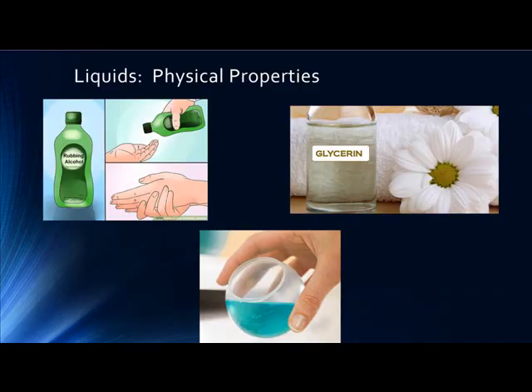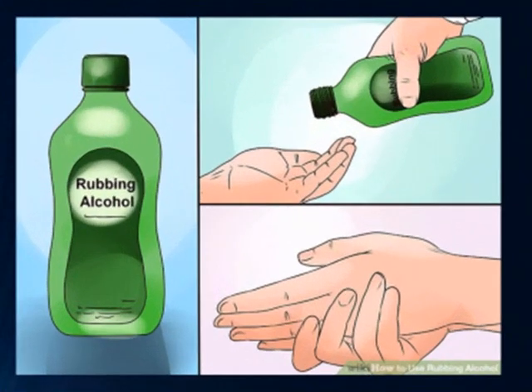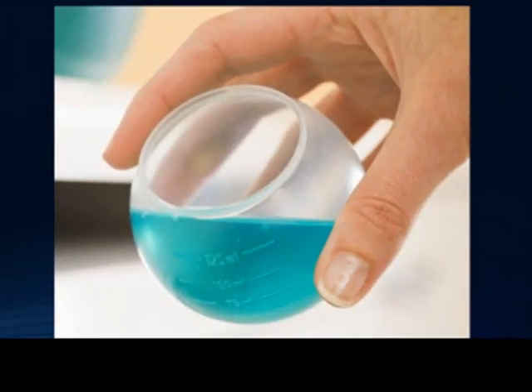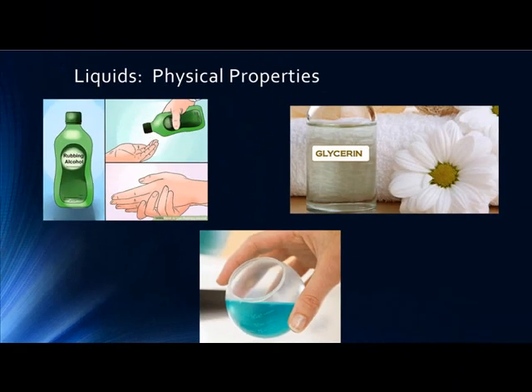This lab will introduce you to a type of alcohol, isopropyl alcohol, which is also known as rubbing alcohol, and will provide you with an opportunity to compare its physical properties to that of 3 other liquids: glycerin, water, and detergent. Surprisingly, glycerol, the major component in glycerin, is also a type of alcohol, but with a much larger molecule. Detergent is a synthetic cleaning agent that acts like soap.